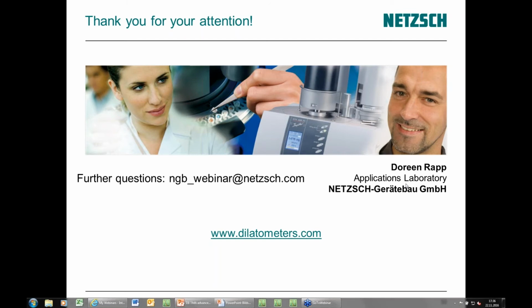There was one question I already received in advance. So it was about the difference between dilatometer and TMA regarding the measurement of polymers. So which is the suitable technique here? So the TMA is the method which is mainly used in polymer applications. So here you can apply very small forces to your sample in comparison to the dilatometer. And you also have here other modes available like penetration or 3-point bending or also tension mode.